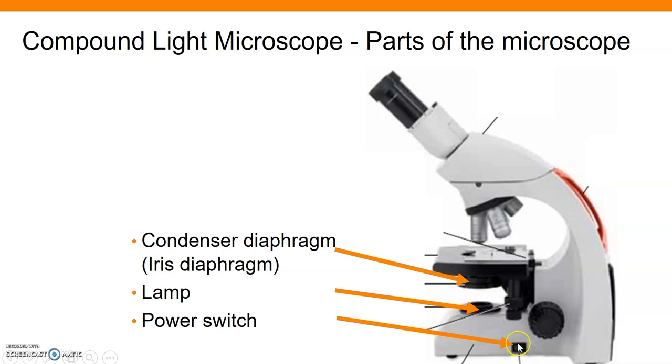We also have the power switch, the on-off switch. That's this little green button down here that you'll find pretty easily. Just turn on and off the microscope as long as it's plugged in.